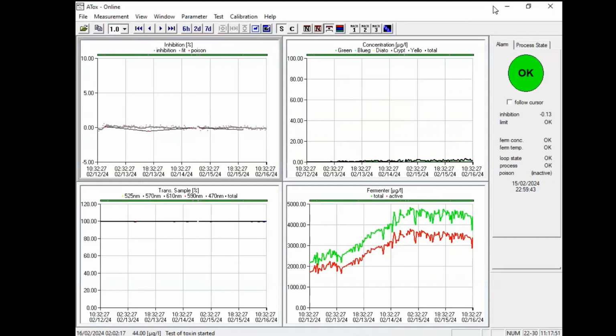This is a major cleaning process which takes place several times during a measurement cycle, and it ensures most of the cleanliness because it's emptying and rinsing the sensor.